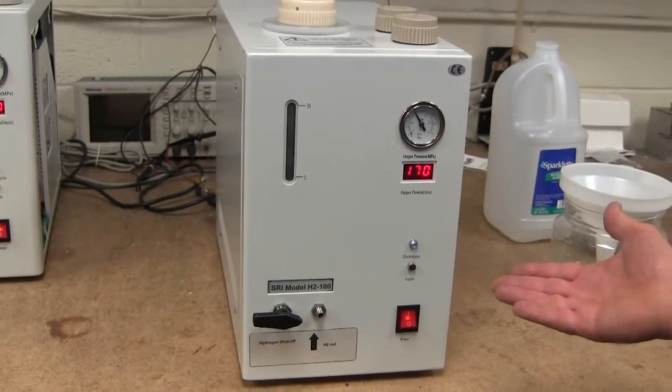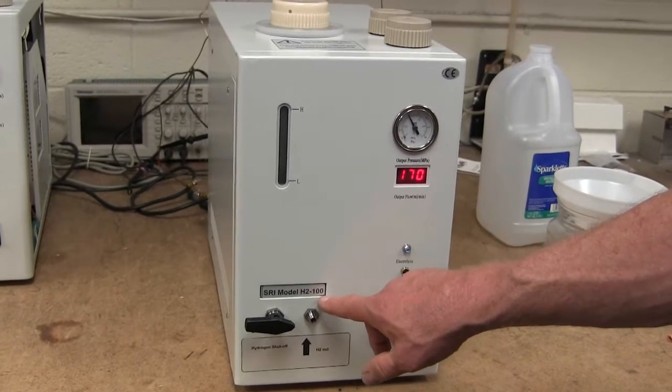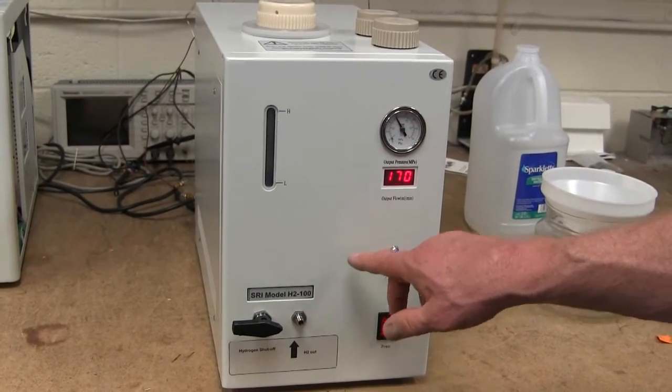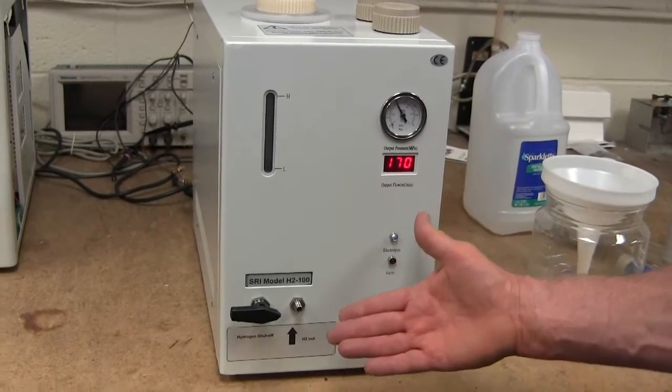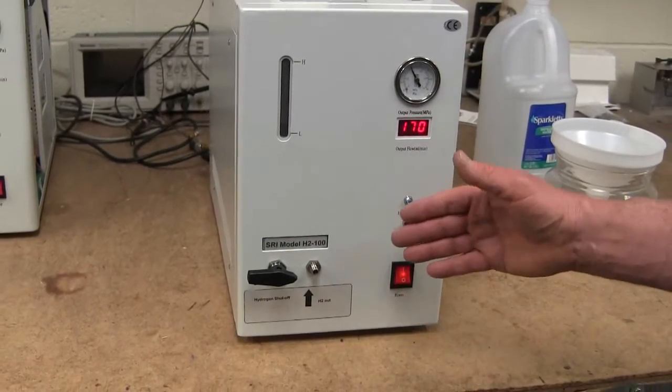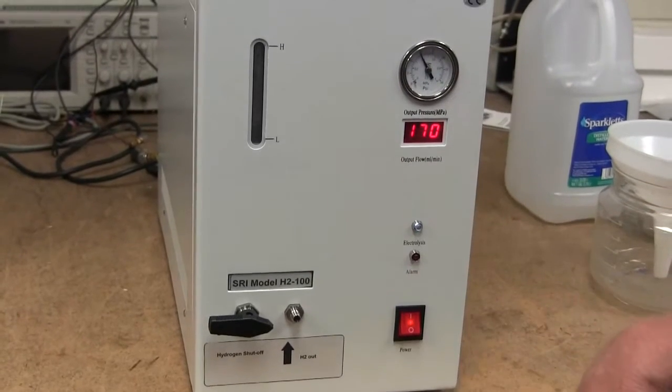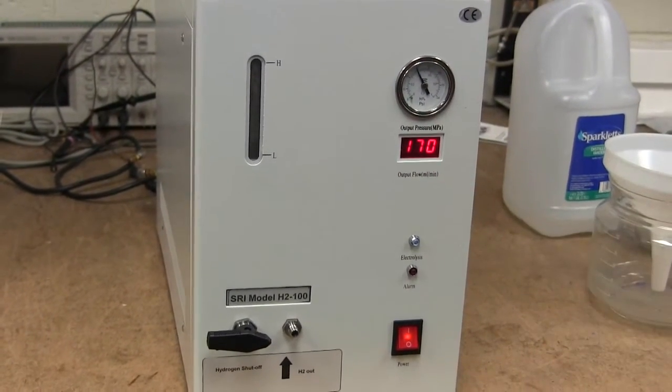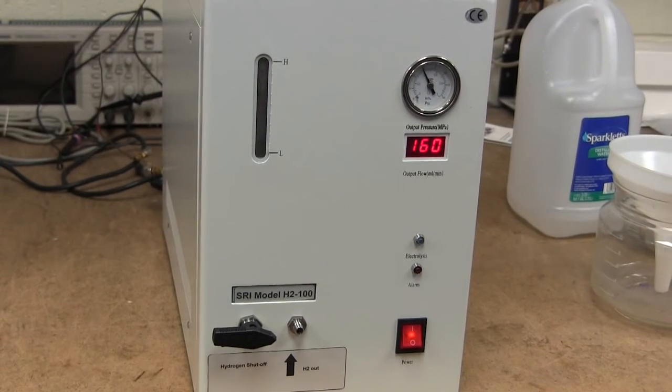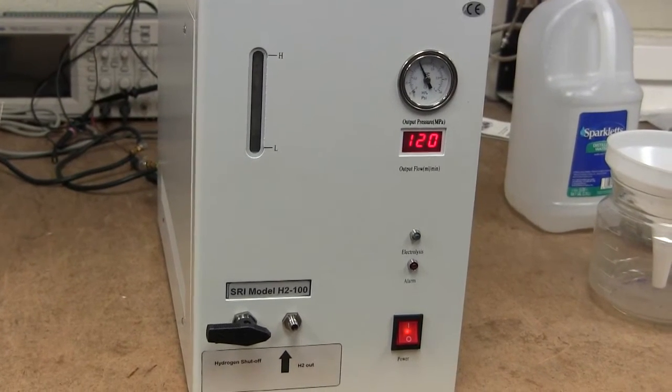We call this an H2-100 to reinforce the idea that 100 is really the maximum amount of gas. 100 milliliters a minute is the maximum amount of gas that we really want you to let escape from the hydrogen generator. If you run it at its maximum all the time, then it's going to break at some point. So it's better to run it at less.